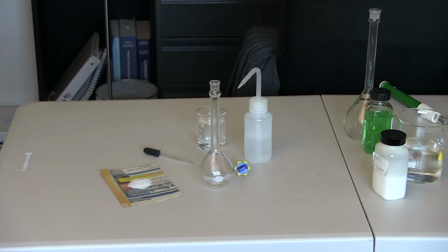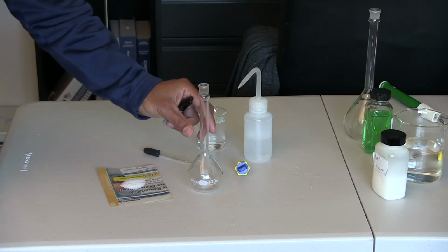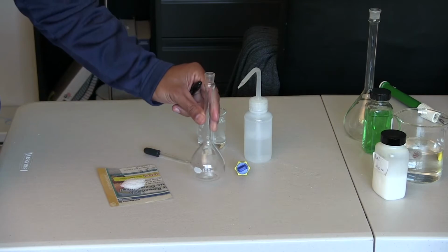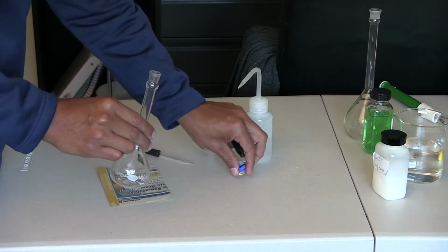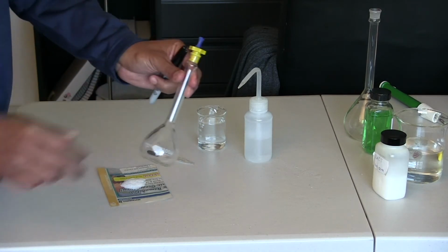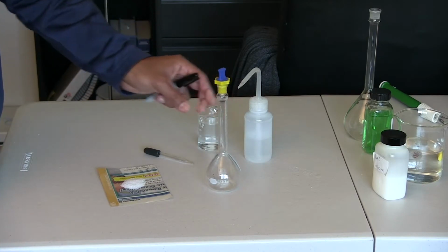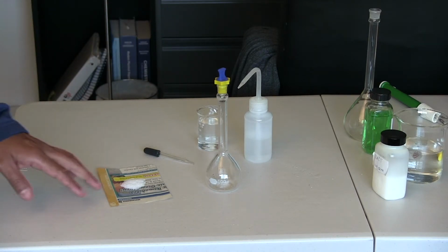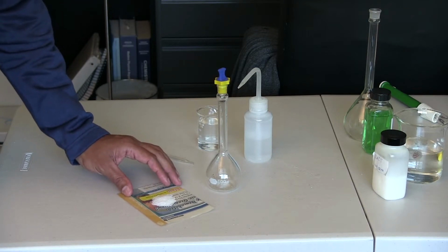Okay, so the whole task here for the first part of experiment number 11 is to prepare a 100 milliliter solution of salt. So this is what a volumetric flask looks like. This happens to be 100 milliliters because that's what we want. We want our final volume, our total volume, to be 100 milliliters. That's how much we need. And this is the amount that you guys are supposed to calculate. How much salt are you supposed to weigh on the scale?